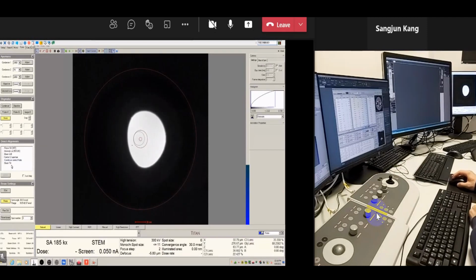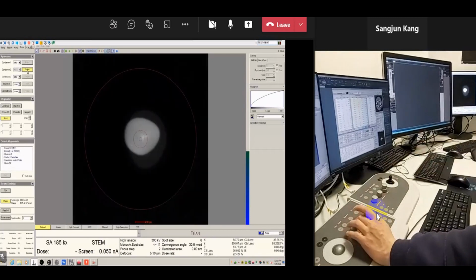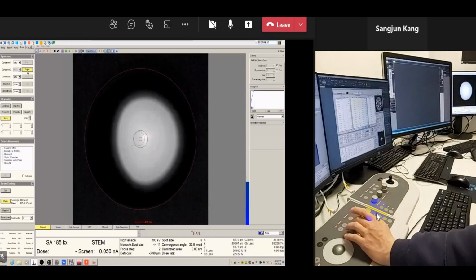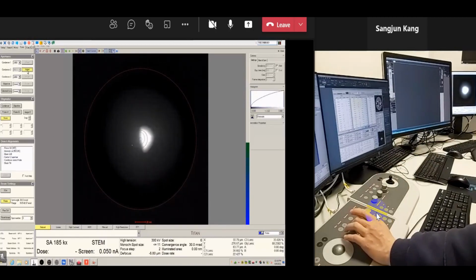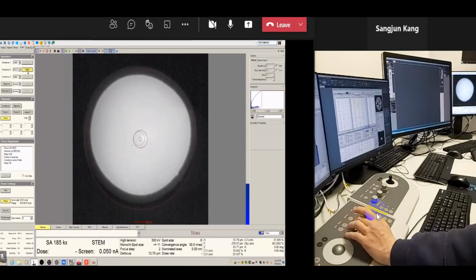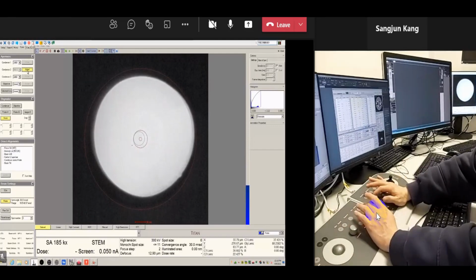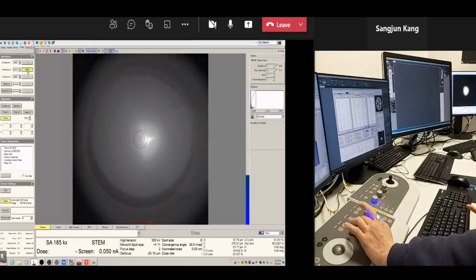One can use such a panel, but personally I really like to tune manually. So we are wobbling the intensity now to see where the center is, but it's more or less correct already. A very little bit off, but I do not really want to change much because it's already good.